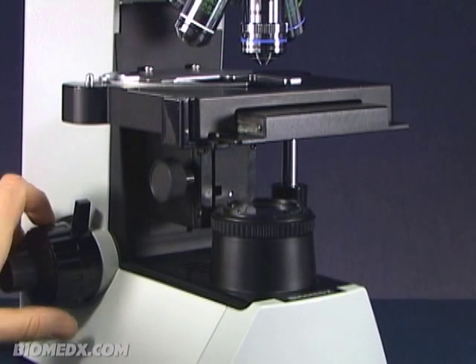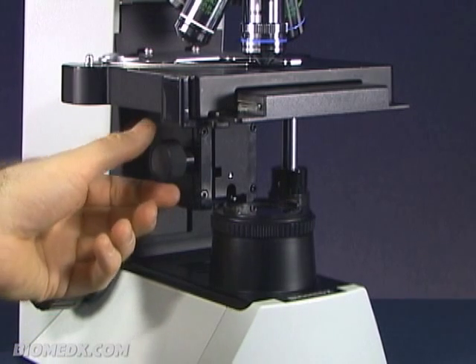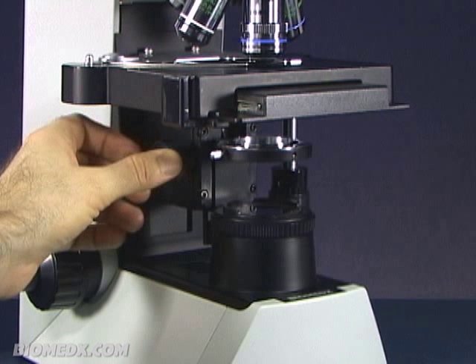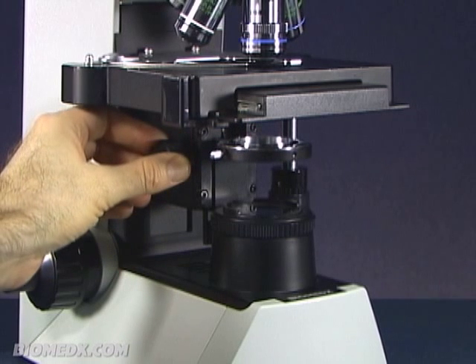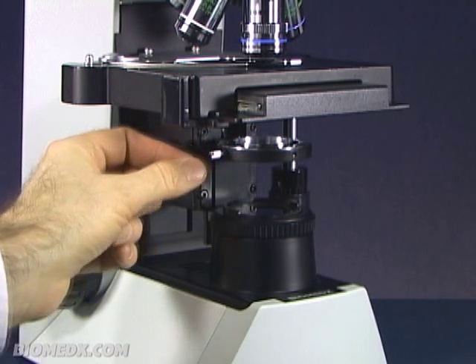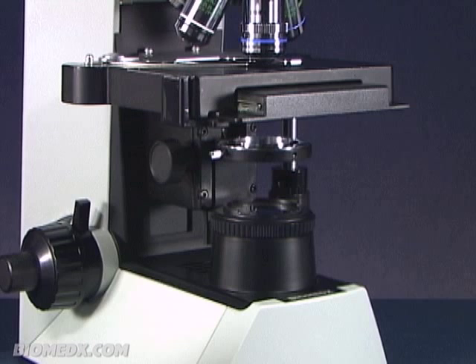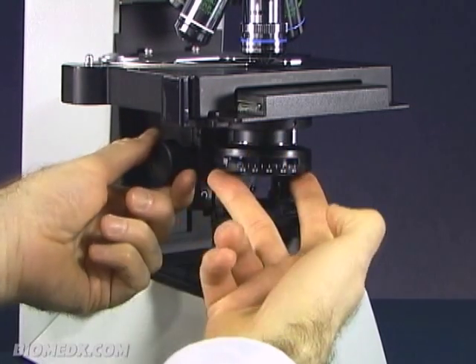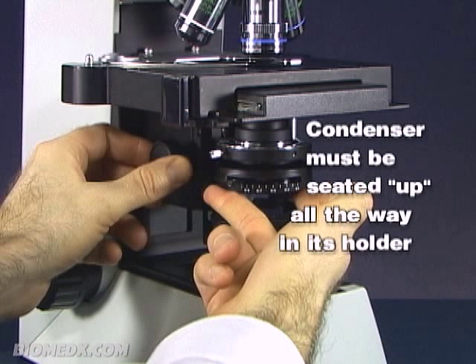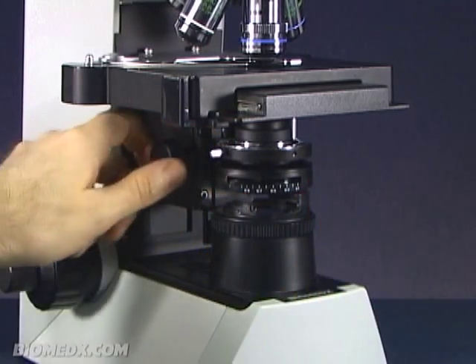To place the condenser in its holder properly, you will need to raise the stage platform and locate the condenser holder assembly knob that raises and lowers the condenser holder. On this microscope, it is just under the stage, to the back, and on the left-hand side. Upon lowering it down, you will note a set screw on the left side of the assembly. It is important that before you push your condenser up into its holder, the set screw should be loosened lightly. Ease the condenser in place under the holder, center it, and rotate the assembly down while fitting the condenser up into place. When seated, finger tighten the set screw to hold it in place.